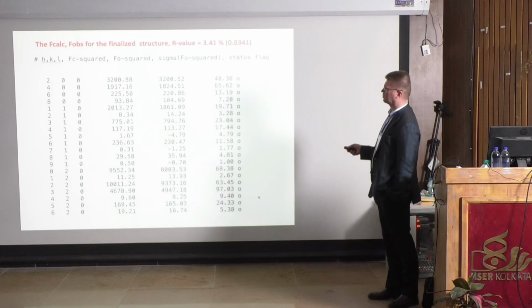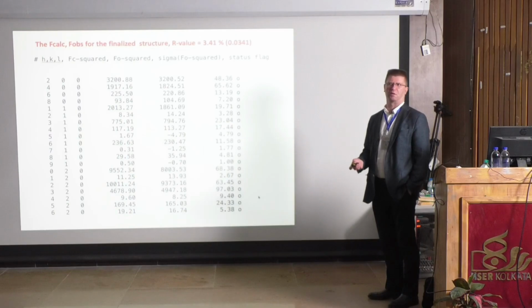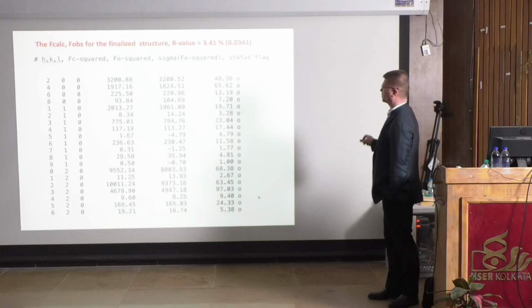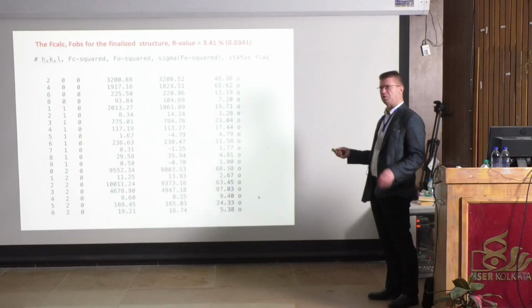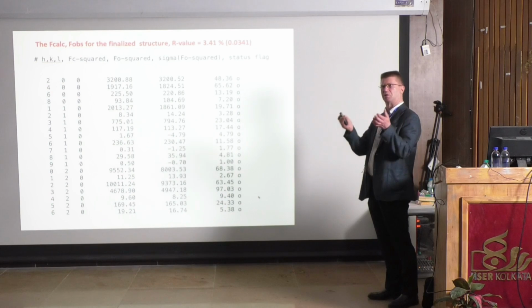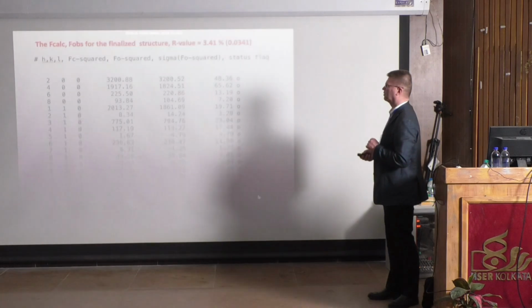You can see they're very close. Look, a tiny difference there, but in general, all these fit about 96%. And this is a very good value. So then we are happy, everything is there, and that's the idea. This is just the standard deviation of these values. But that's what we do. We create, from the electron density map, a model for our molecule and then compare these two things. And this is actually what we are doing.